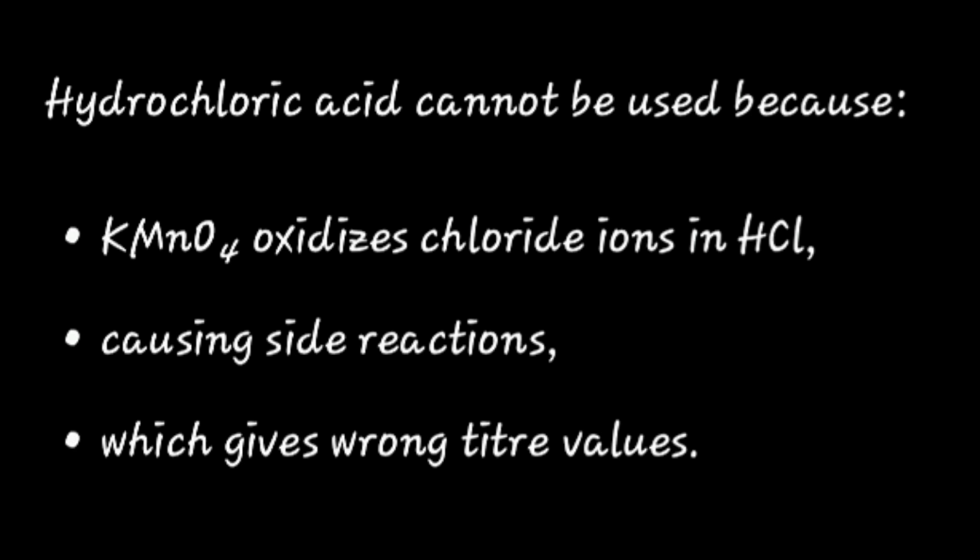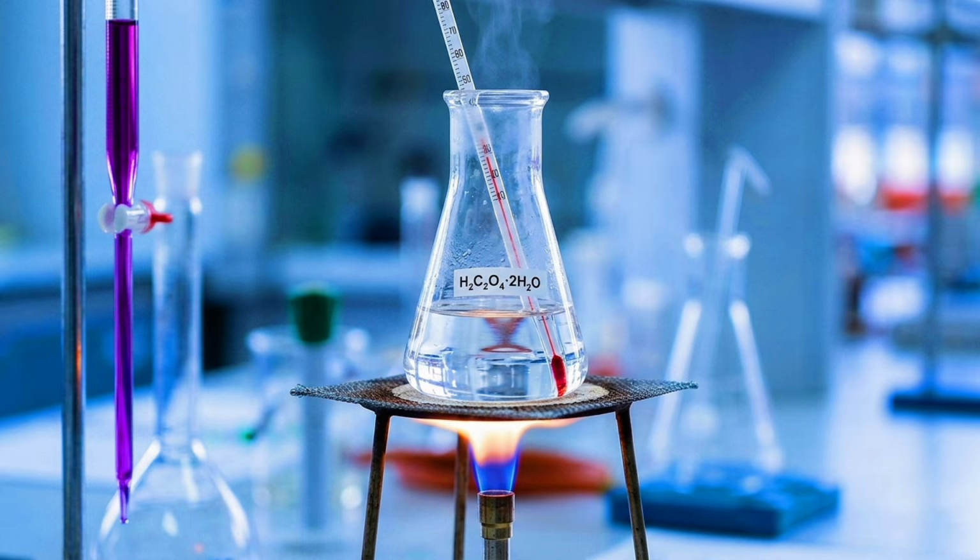Now, when oxalic acid is going to react, the reaction will be slow when the oxalic acid is cold. So the reaction is slow when it's cold. So you know your normal knowledge of reactions that are slow, you increase either temperature or other parameters. If you increase temperature, the reaction goes faster. So we are going to increase the temperature of this oxalic acid so that the reaction will become faster. That's to say, we're going to warm the oxalic acid before we use it.